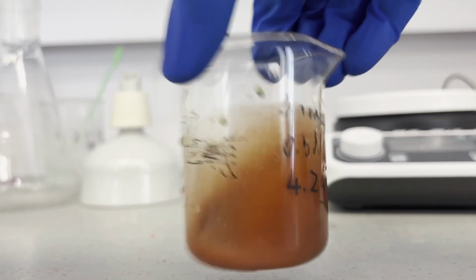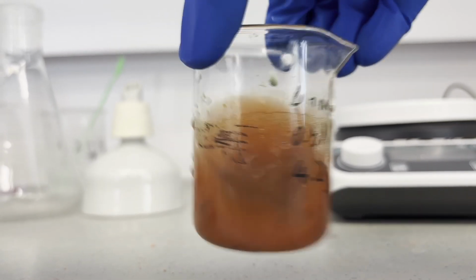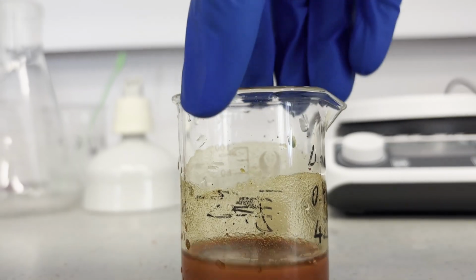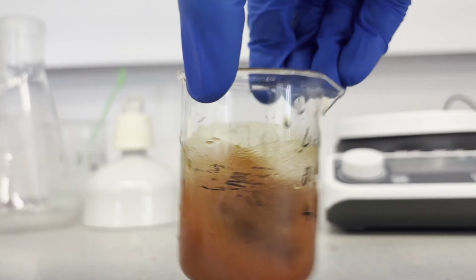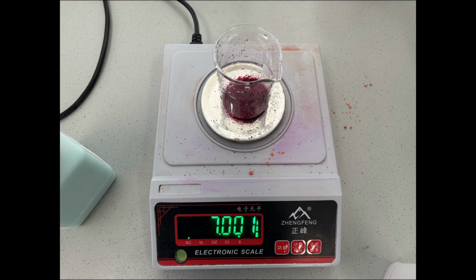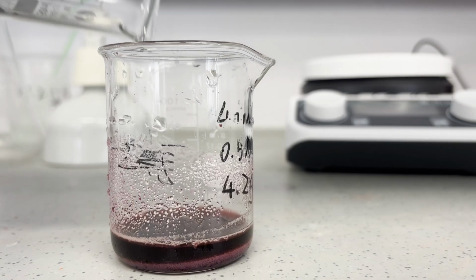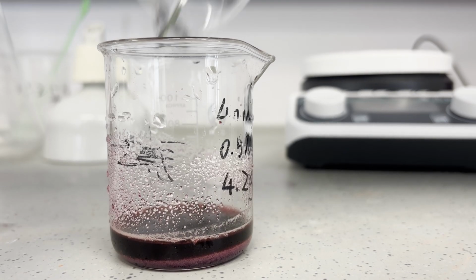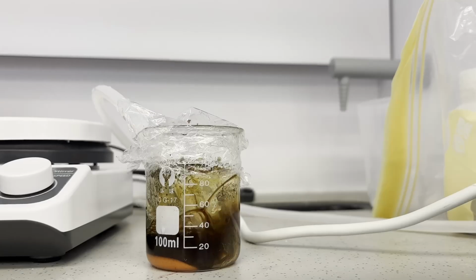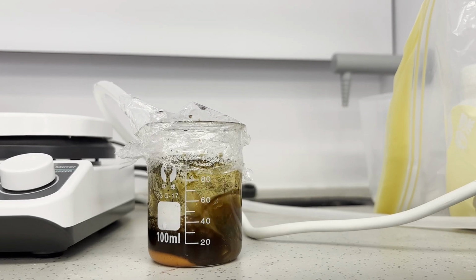The amine complex, hexaamminecobalt(III) chloride, was one of the most famous and popular cobalt(III) complexes, but its synthesis happened to be quite difficult to tackle for me. For my first attempt, I mixed 7 grams of cobalt(II) chloride hexahydrate with 5 grams of ammonium chloride and 6 ml of water, and added 0.2 grams of activated charcoal as a catalyst. 13 ml of concentrated ammonia is then added in, and air is blown through the mixture for around 4 hours.